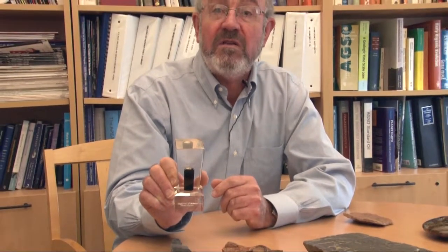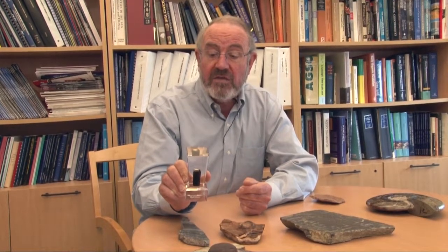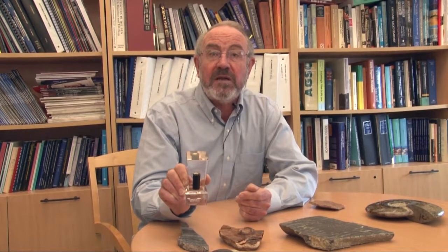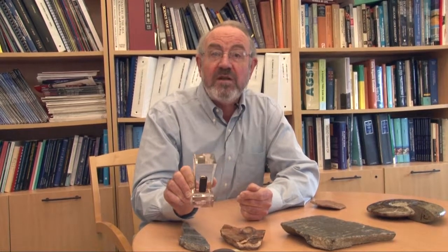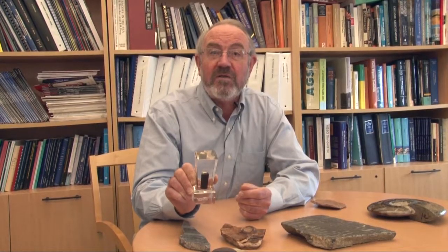We can find the remains of photosynthetic pigments, for example. We can find the remains of membrane lipids. And our job as a geobiology and astrobiology laboratory is to focus on ancient sedimentary rocks and see if we can find molecules that tell us something about the organisms that lived in the past. And as we go further back in time, it becomes more and more difficult because the rocks have seen high temperatures, high pressures, they've been folded, they've been weathered, and they've been colonized by contemporary organisms. So it's a difficult process to disentangle what's ancient and what's modern.